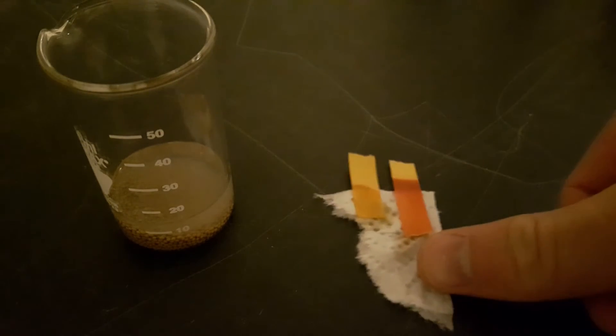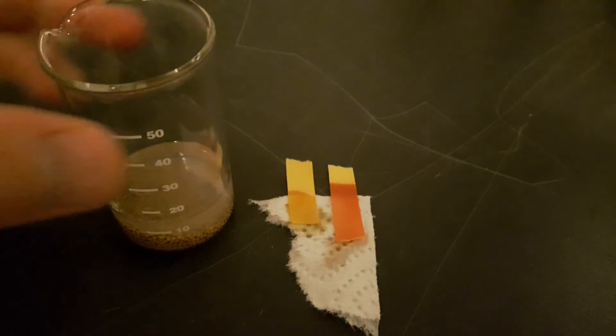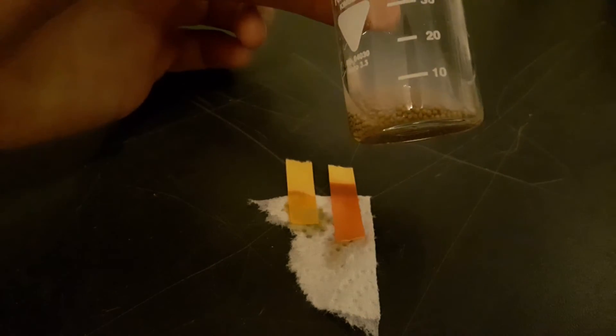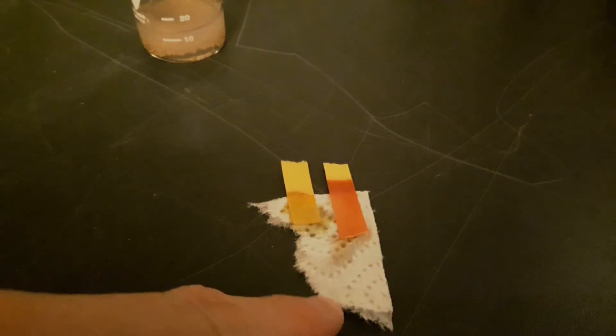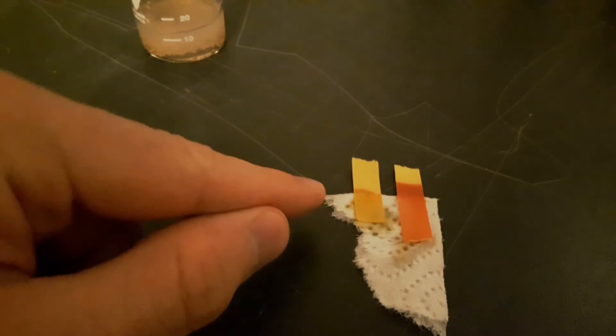And now I take the pH of my acid molecular sieves mix, and you see it's actually a lighter red. So, the pH increased, which means there are less H+ ions.